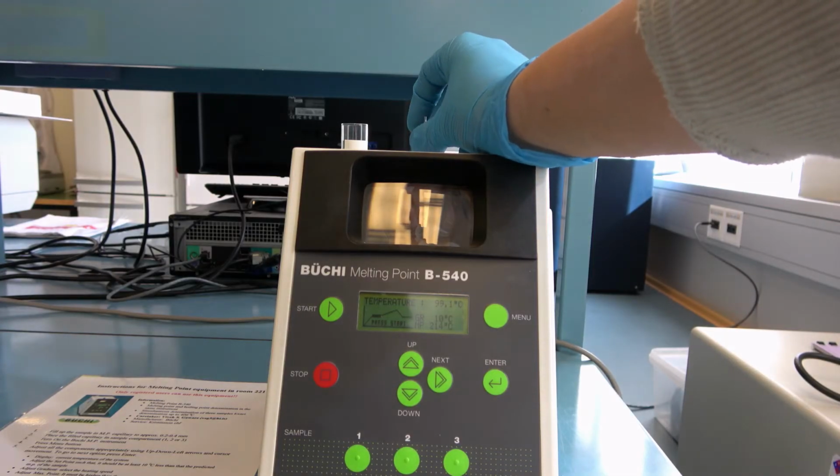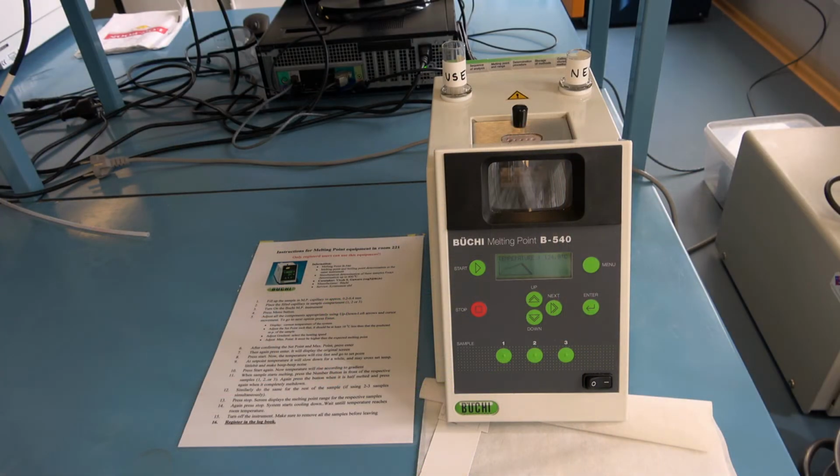Finally, the sample is removed and placed into the used tube on top of the device. The instrument is then given time to cool down to room temperature, and then the instrument can be turned off.